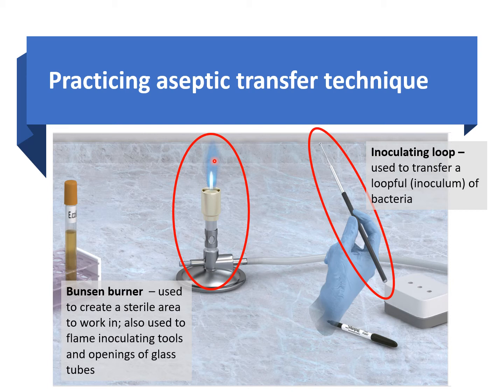No, you've got to take your time, take that loop, and pass it through the flame until the loop turns orange red. You've got to make sure that this whole entire part, not the part you're holding, because the part that you're grabbing has a plastic coating, so you don't want to pass that part, otherwise it will melt. You only want to pass the metal part, okay?